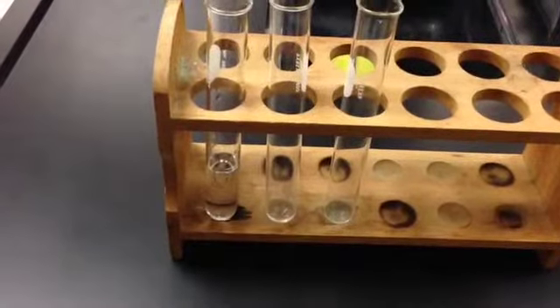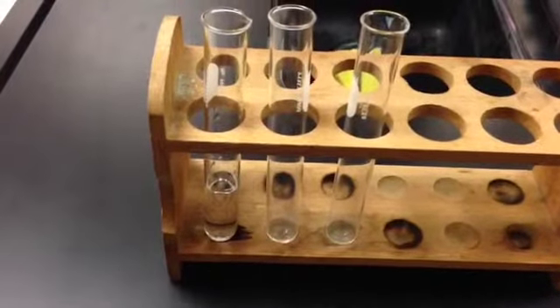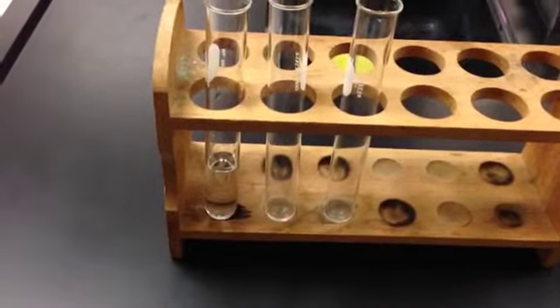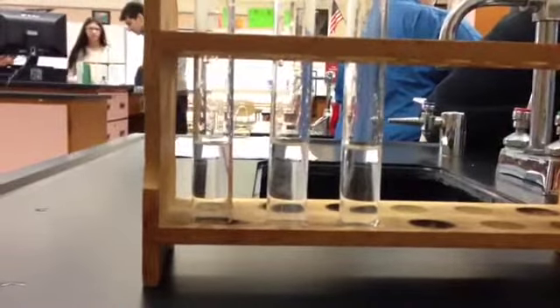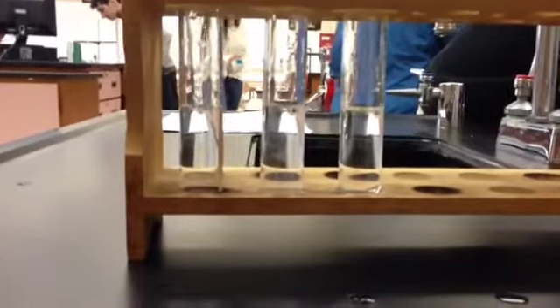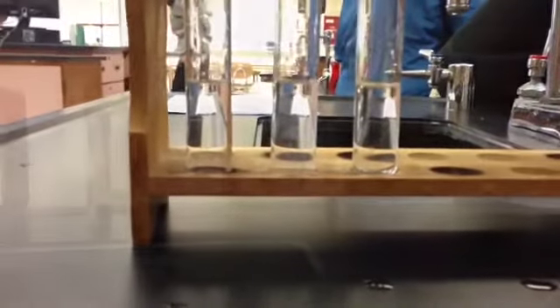As you can see, I have 3 test tubes, and I used a 10 milliliter graduated cylinder to measure out water so each are the same. Now that I have all 3 test tubes filled with the same amount of water, I am going to pour salt into each one of them, but different amounts.